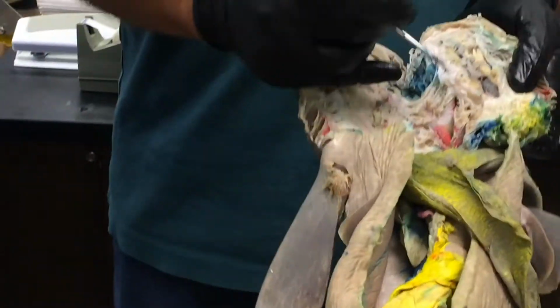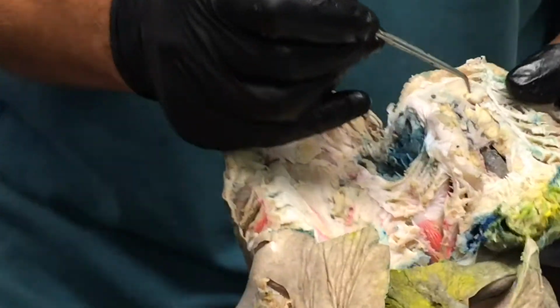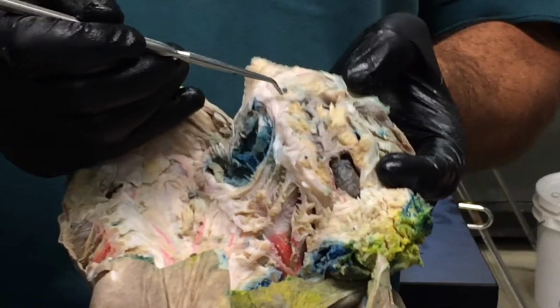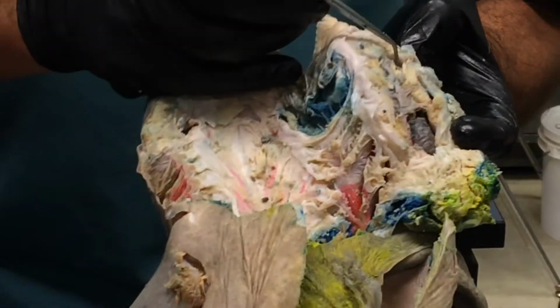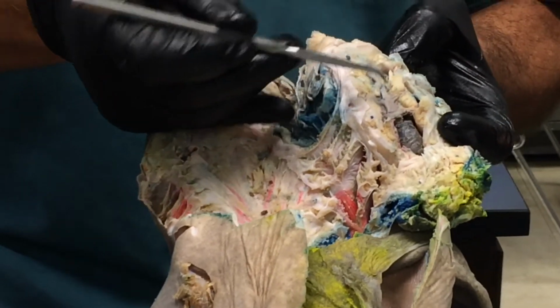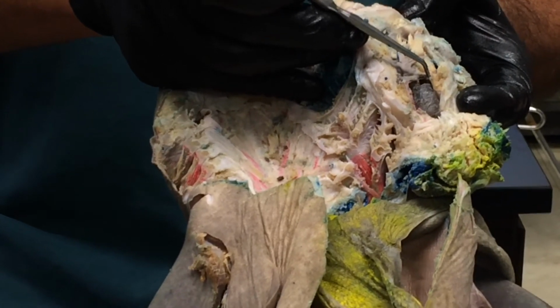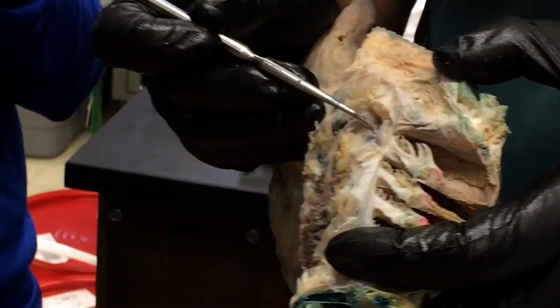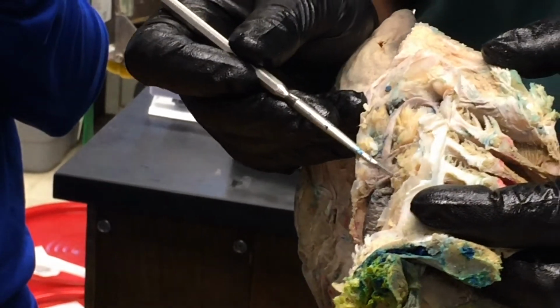Okay. So here's the heart. There's the ventral aorta coming forward out of it. And you can see the afferent branchial arteries here. And there's this big fork at the front end of the ventral aorta. And that branches to give rise to the first and the second afferent branchial arteries. This is the third. And then back here, we have the fourth and the fifth afferent branchial arteries. Come off very close to each other. Okay, so for you guys here, here's the first and the second afferent branchial. There's the third, and here's the fourth and the fifth coming off.